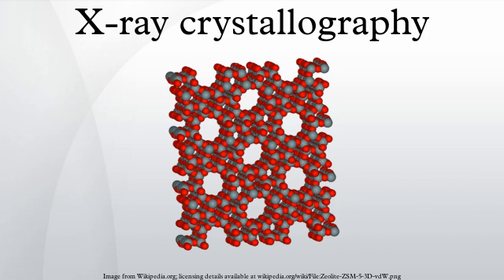Elastic versus inelastic scattering. X-ray crystallography is a form of elastic scattering. The outgoing X-rays have the same energy, and thus same wavelength, as the incoming X-rays, only with altered direction. By contrast, inelastic scattering occurs when energy is transferred from the incoming X-ray to the crystal, for example, by exciting an inner shell electron to a higher energy level. Such inelastic scattering reduces the energy of the outgoing beam. Inelastic scattering is useful for probing such excitations of matter, but not in determining the distribution of scatterers within the matter, which is the goal of X-ray crystallography.